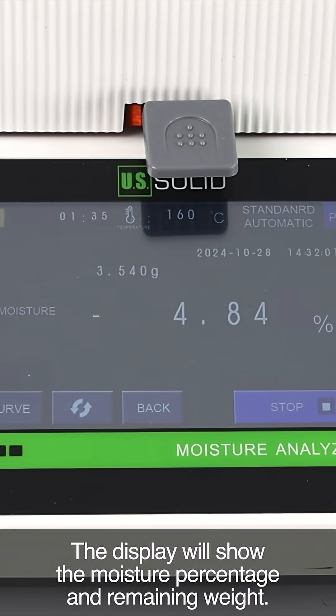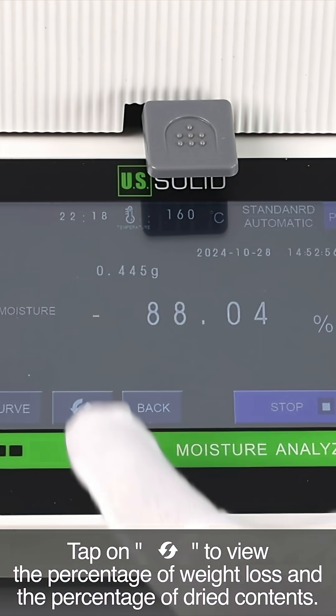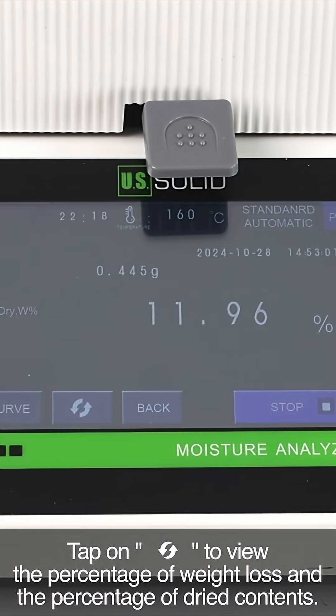The display will show the moisture percentage and remaining weight. Tap on refresh to view the percentage of weight loss and the percentage of dry contents.